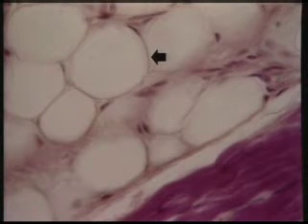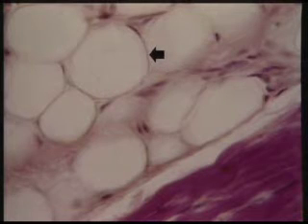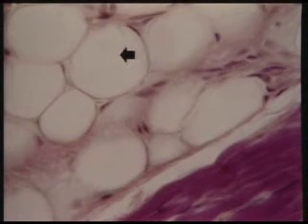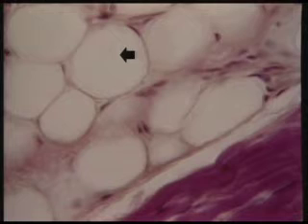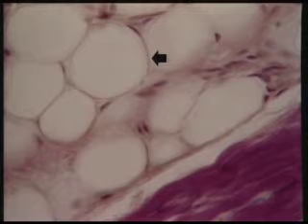As you've probably gathered from the images you've seen so far, cells differ radically in size and shape from one another. And here's an odd-looking one. The arrow is pointing to a fat cell here, and it looks like a large soap bubble. One reason for that is that fats are extracted during tissue preparation for light microscopy. This is a fat cell or adipocyte, and what's happened here is that the entire, or almost the entire cytoplasm of the cell has been filled with lipid.